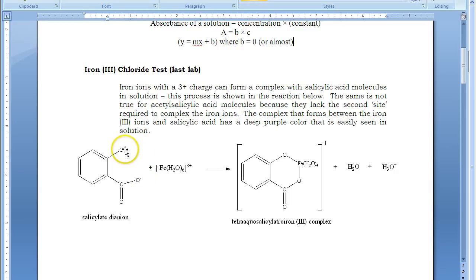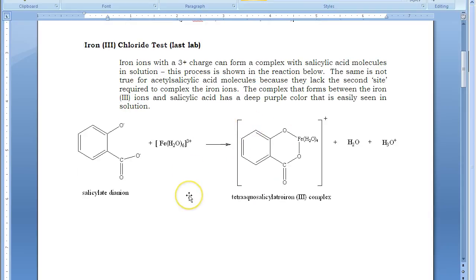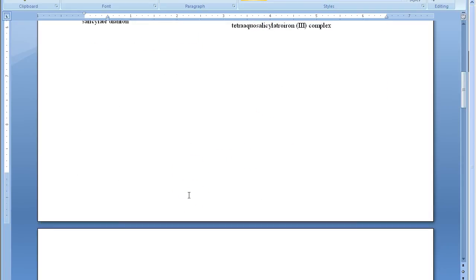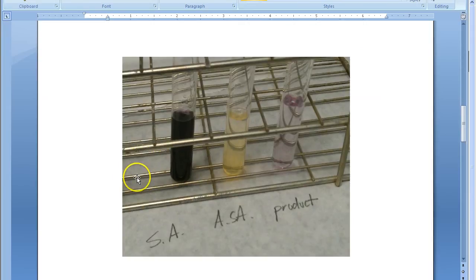This complex now had that deep purple color that you might recall from lab last week. And the greater the amount of salicylic acid present, the stronger that purple color.